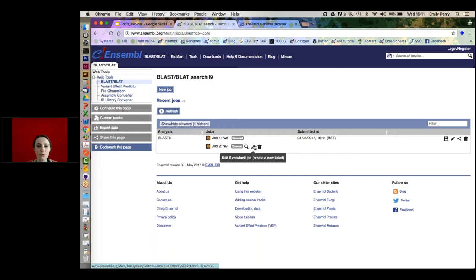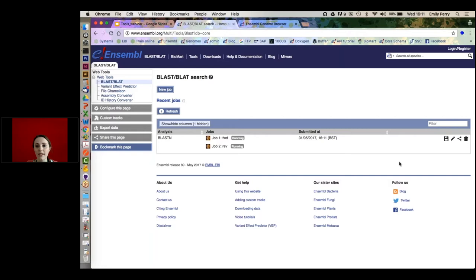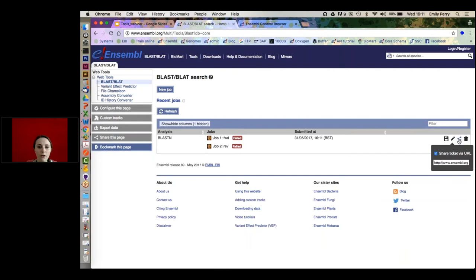This gives me a jobs table, which appears in all the different tools. Every 10 seconds it refreshes, showing the two jobs stored separately and telling me they're currently running. I can save these jobs to my Ensembl account — accounts are free, nobody ever sends spam email, and they allow you to save jobs.